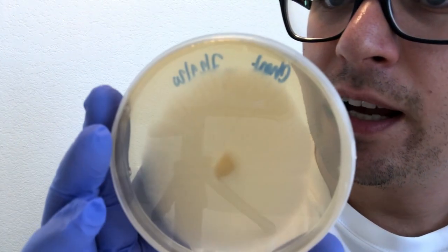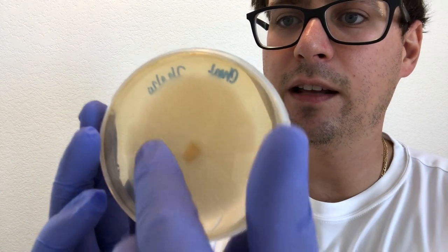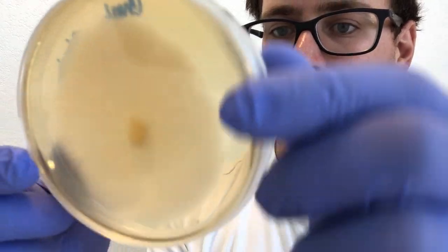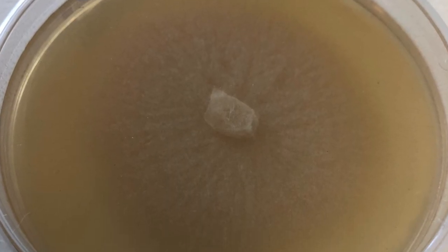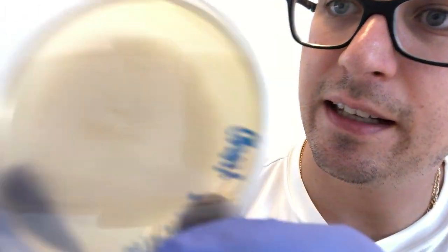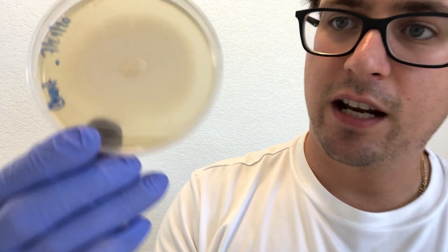Now we've got a chanterelle. You can see how this one has a little bit more irregular form, so it's not gonna be a perfect circle every time. It has different filaments, different sizes, and it's slightly cottony on the edge. I'm really excited—I got some chanterelle mycelium. I'm gonna be doing some experiments in the fall with this. Hopefully I can figure out how to fruit that.